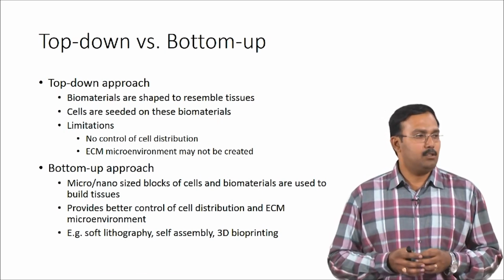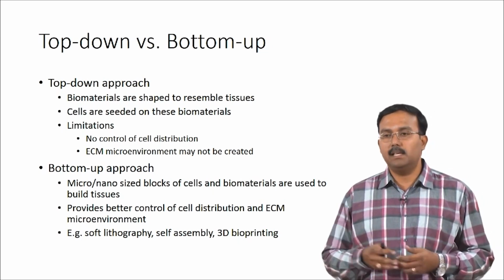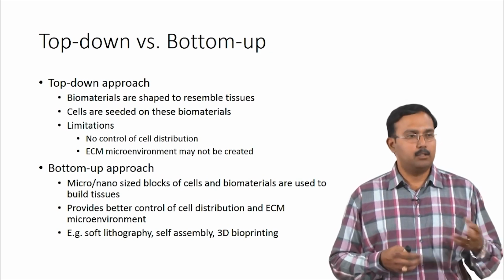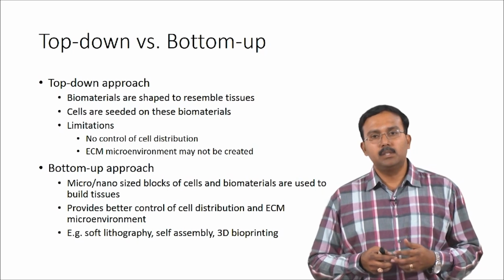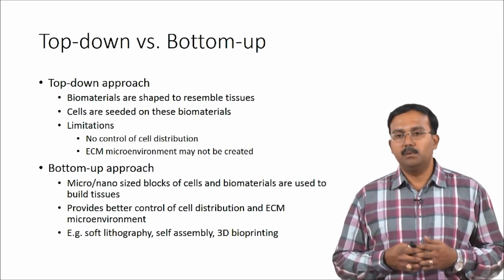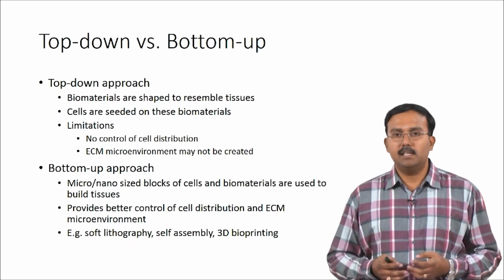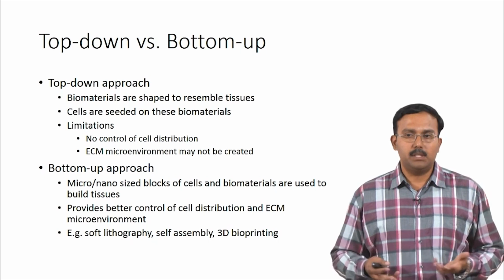There are many techniques to do this. Some of the techniques are soft lithography, self assembly, and 3D bioprinting. Today we will talk about 3D bioprinting. In tomorrow's lecture we will be covering self assembly. The other techniques which we looked at earlier were all top down approaches, where we were talking about freeze drying or solvent casting and salt leaching.